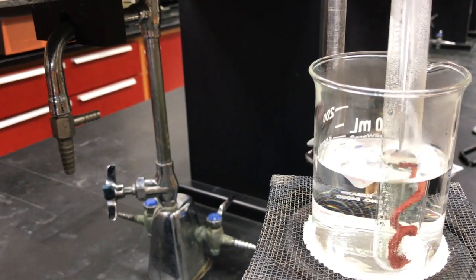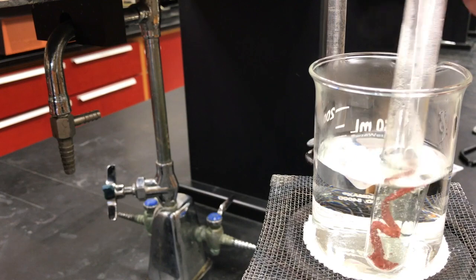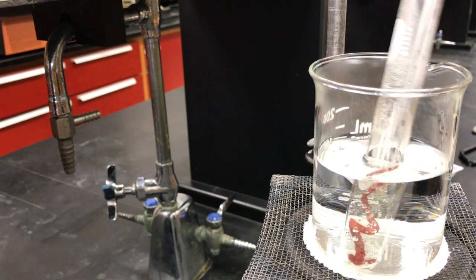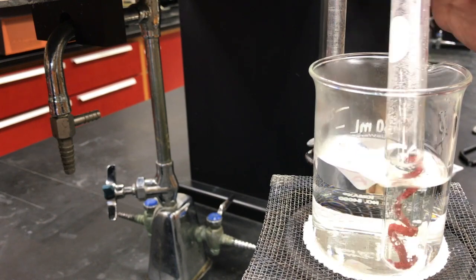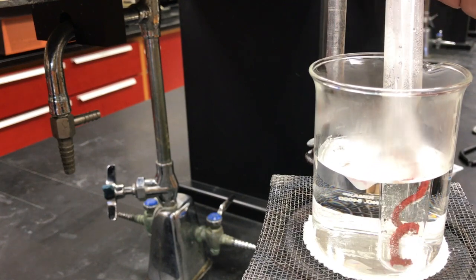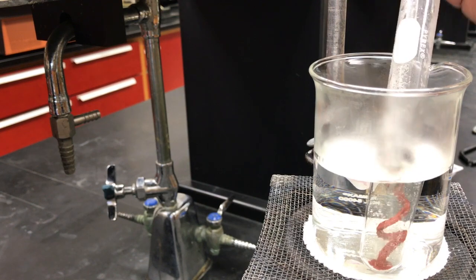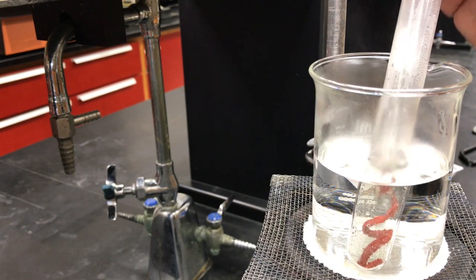Now I'm using a glass stirring rod and knocking off some of that copper that's formed on the surface of the wire. And by doing that, it's going to allow more of the copper in solution to access the metal wire, the aluminum wire, and help complete the reaction. But notice how the color is almost completely clear. Right, so we dissolved the copper compound at the beginning and gave it a teal color to the solution, but now the color of the solution is clear, which means all of the copper that was present is in the form of the solid copper that is now clinging to the wire.